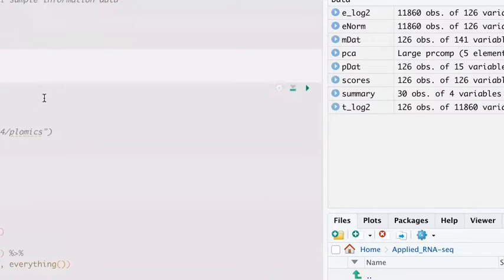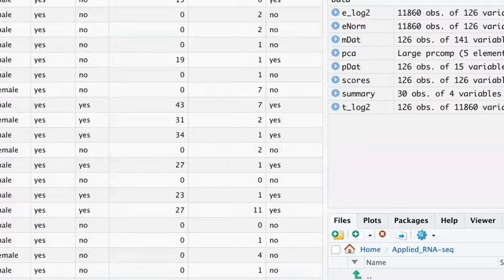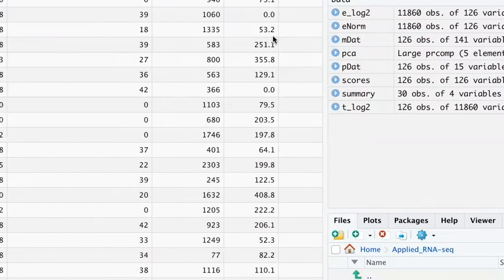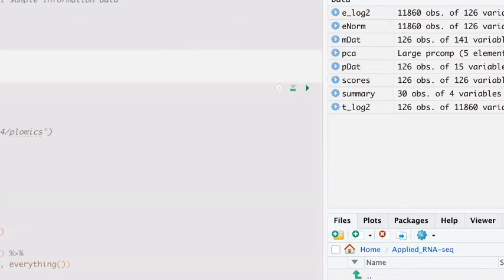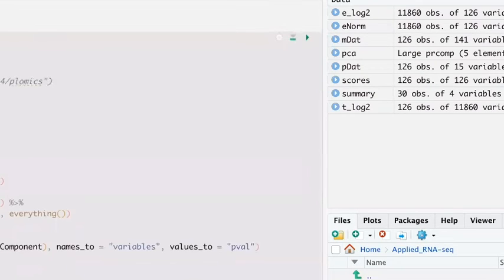Now we're going to do a correlation to check which of our variables, all of our variables within PDAT, are actually contributing to the variation that we see in our data. We're going to use a package called the PL-omics package. This was actually written by Victor Yuan, now Dr. Victor Yuan from the Robinson lab, and he's made it very easy to run this function.